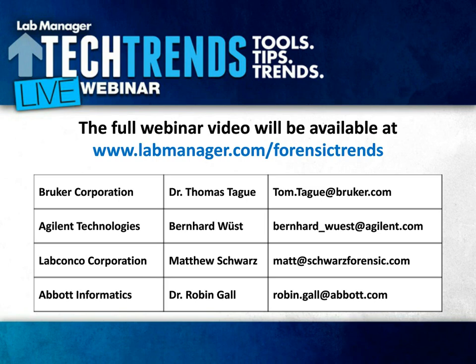Bernhard, how easy is it to transfer LC or LCMS methods to SFC? There is, as I presented, basically no direct correlation between LC and SFC. So building a method development system with multiple valves and multiple columns is the easiest way to move forward, but there is less hands-on, but still some time involved to run a lot of experiments to find out which gives you the optimum separation for the compounds you would like to analyze.